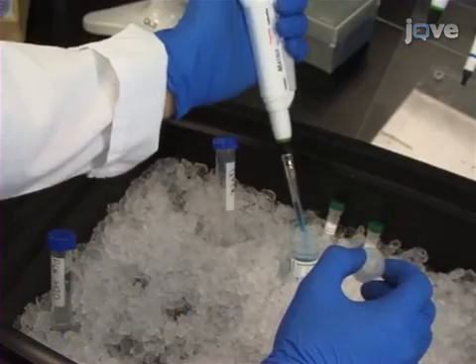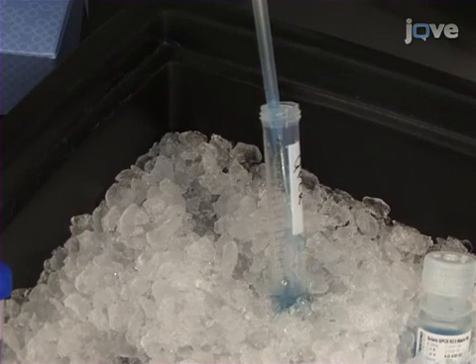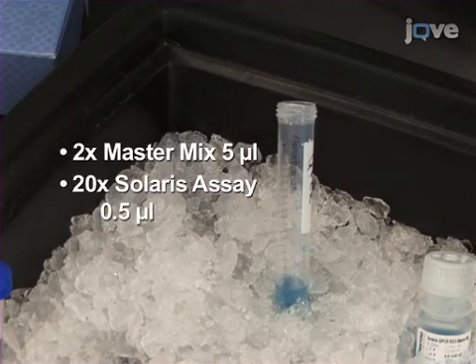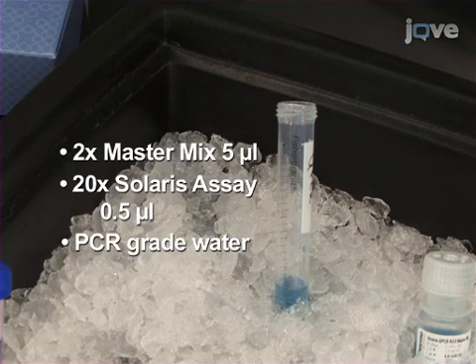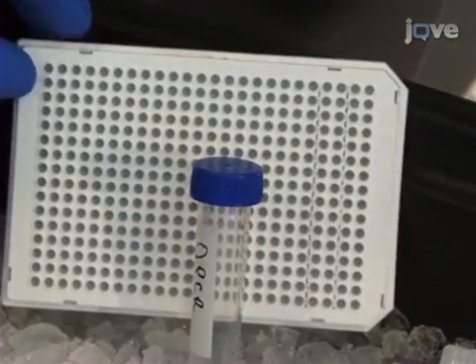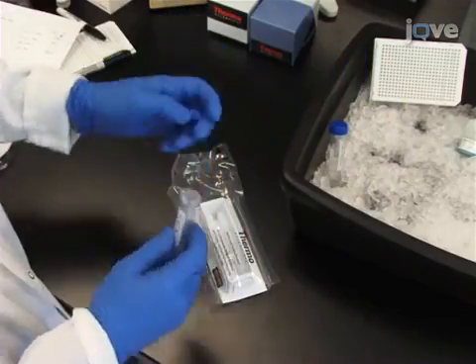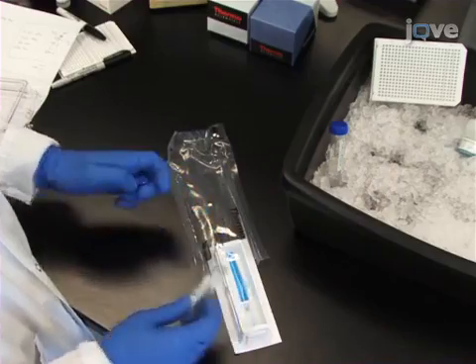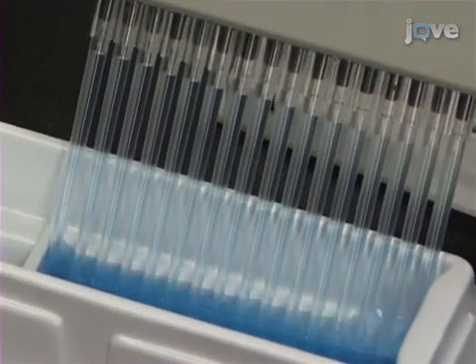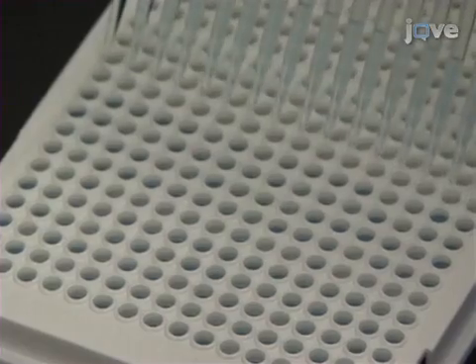In a 15 milliliter tube, prepare 1x Solaris qPCR assay and master mix by combining, for the desired number of samples on a 384-well plate: 5 microliters of 2x master mix, 0.5 microliter of 20x Solaris assay, and PCR-grade water so that the final volume in each well will be 10 microliters after the cDNA is added. Be sure to prepare enough for three replicates of each sample, including a no-template control (NTC) and a no-reverse transcriptase control (no-RT) to check for contaminated reagents or contaminating genomic DNA, respectively. Transfer the mix into a sterile reservoir, then using a multi-channel pipettor, transfer the appropriate volume of 1x master mix to the appropriate wells of the PCR plate. If white plates are used, the inert blue dye included in the master mix will aid in tracking pipetting progress.